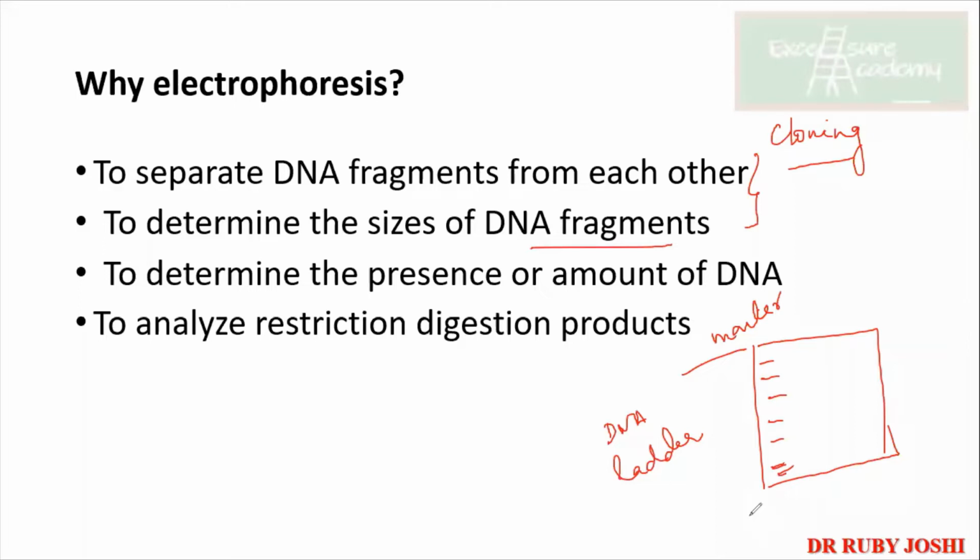Now these are also ready mix. So directly, depending on the company requirement, you will load either 1 microliter or 2 microliters, not more than that. That is more than sufficient to get the visualization of the DNA marker. Okay, so suppose you have got a band over here.